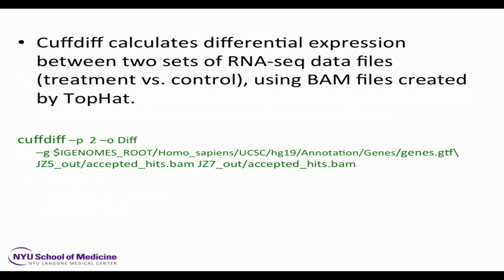Instead, for today's tutorial, what I want you to run is cuffdiff, which is actually a separate command that's part of Cufflinks. It does the mapping of the reads to known genes, and it does the counting of reads to known genes using the annotation map, and it does the comparison from one sample to another with a statistical test all in one step. So it's essentially a script that runs a bunch of tools in series to generate differential expression values rather than single sample expression values.